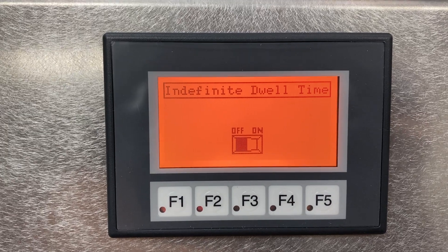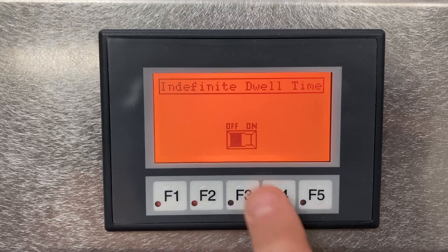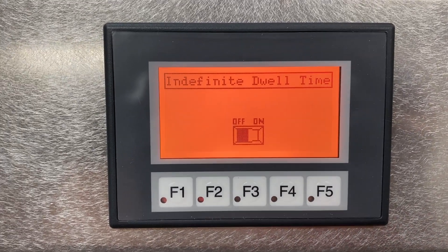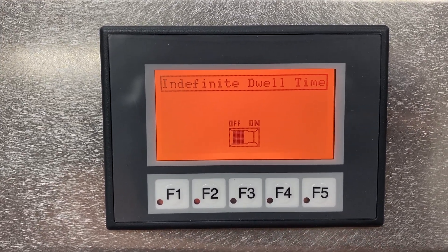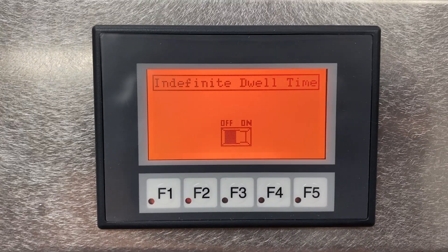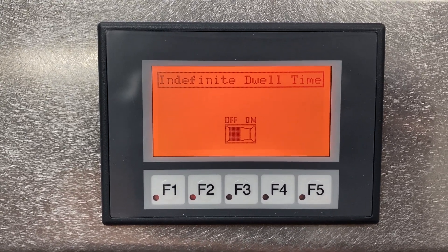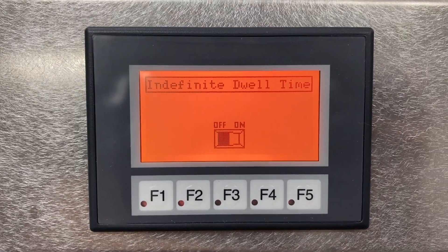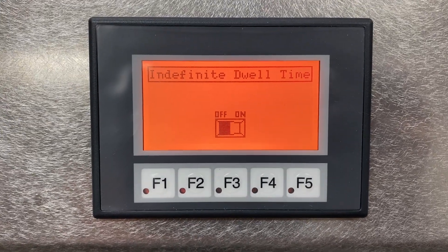This screen is for setting the dwell time to infinite. When you toggle it from off to on, it will go to your set target vacuum — in our case 370 torr — and hold it there for as long as the system is plugged in. It monitors the target vacuum and turns the pump on and off. This is a fantastic function if you're looking to do any type of vacuum storage. For the altitude simulation test we're running today, it's not a requirement, but it's a nice function to have.